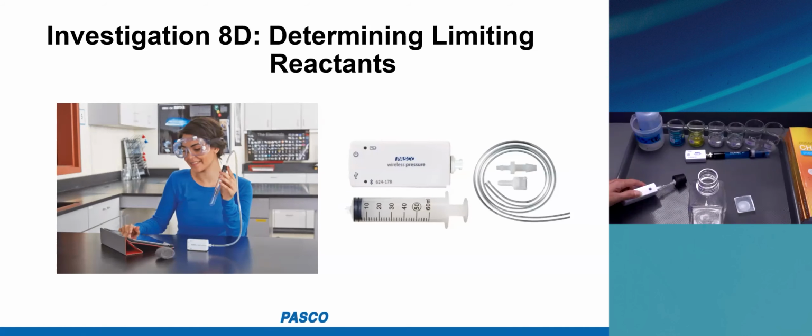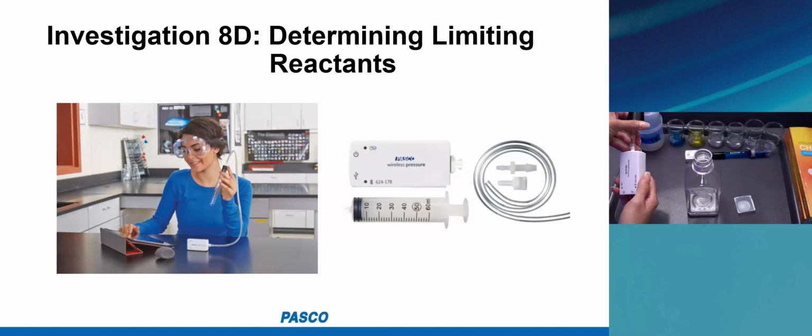Thanks, Heidi. So what we've got here is a container, and this might be for you a 500 milliliter Erlenmeyer flask, or it can be this plastic bottle, or maybe a juice bottle that has the right size hole for a number 6 stopper, because the stopper comes with the sensor. Everything you need comes with a sensor.